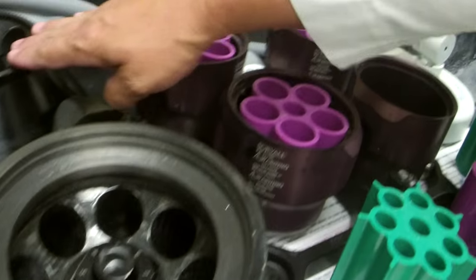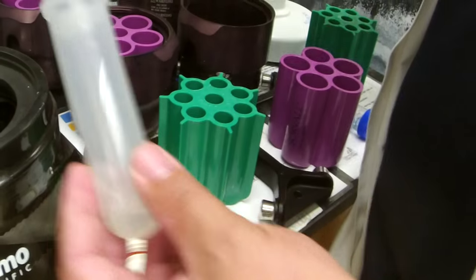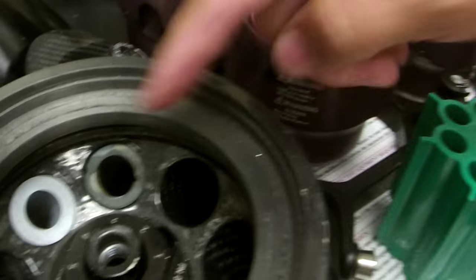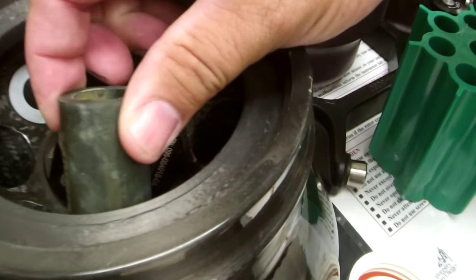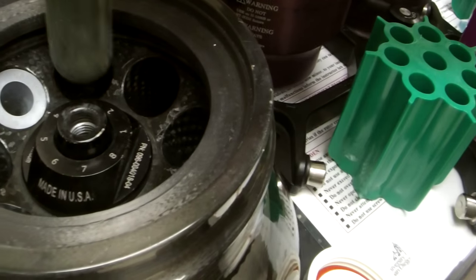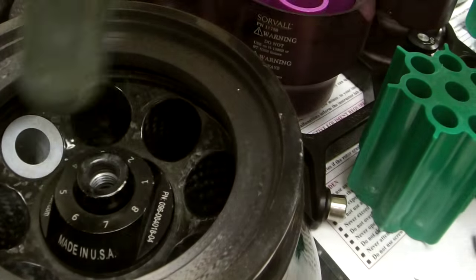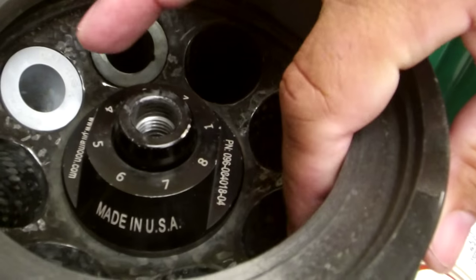The SS-34 and F21 heads use 50ml tubes. We also have adapters for smaller size tubes — sometimes plastic or rubber. Each adapter sleeve fits inside the rotor slot. They have a different mass, so if you use one adapter on one side, you must have the same adapter on the other side. You always balance across the center, not across half. Whatever is on one side must equally and precisely balance the other side.